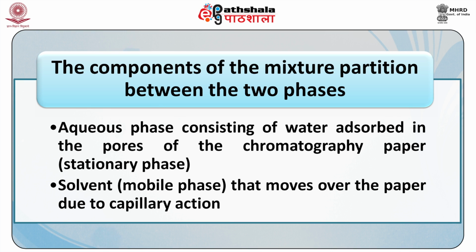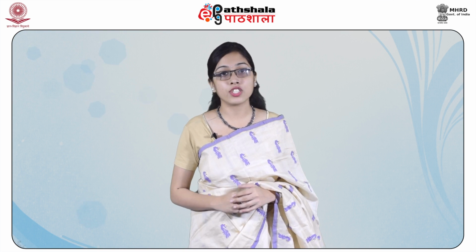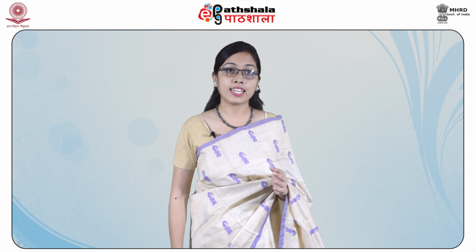The components of the mixture partition between two phases: aqueous phase consisting of water adsorbed in the pores of the chromatography paper, also known as the stationary phase, and solvent, that is the mobile phase, that moves over the paper due to capillary action. The compounds in the mixture get separated due to differences in their affinity towards the two phases. An additional factor could be absorption of the components of the mixture by the filter paper.